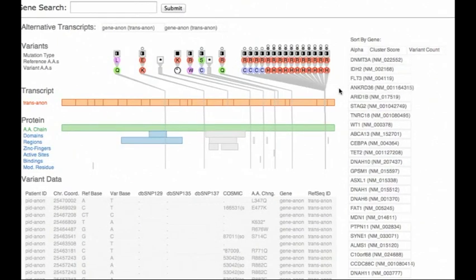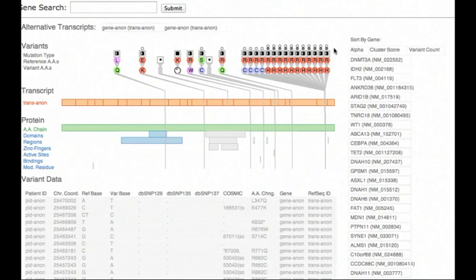Reading the variant visual encoding from the top down shows whether the variant is present in a known harmless or known cancer database with circle encodings, the variant's type with an icon, and the variant's change in amino acids with a combination of letters and colors.